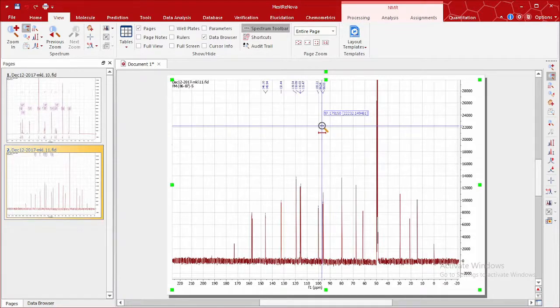Before you can process your HSQC spectrum, make sure you have the proton and carbon 13 NMR spectra. It is also called a two-dimensional NMR spectrum because you have a spectrum in one direction, and you also have a spectrum in another direction, giving you two dimensions.